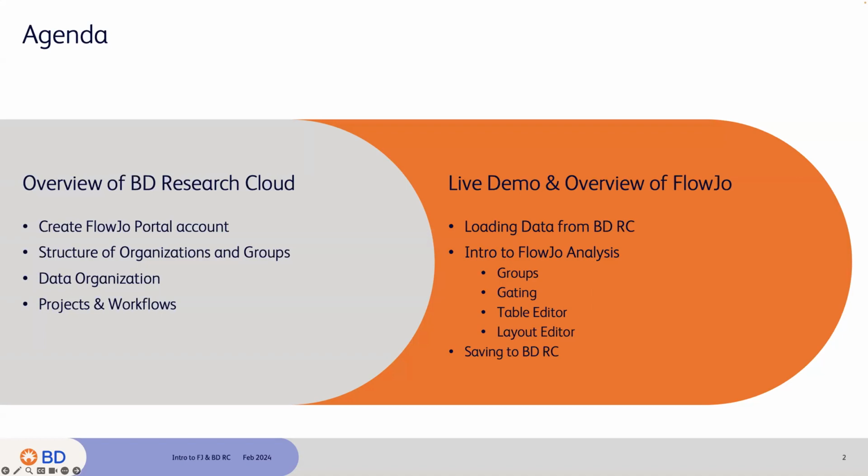However, there are lots of different features that I won't touch on today. I would just say that there are some other pre-recorded webinars you could take a look at that focus on all the features of BDRC. But like I said, today I'll focus more on projects and workflows, and then get into a live demo using FlowJo.